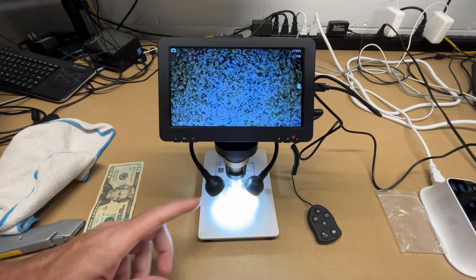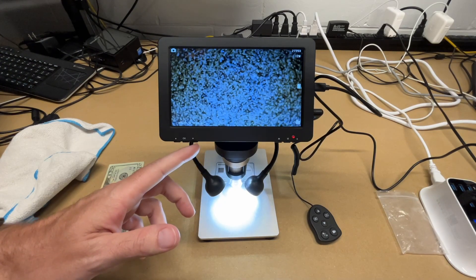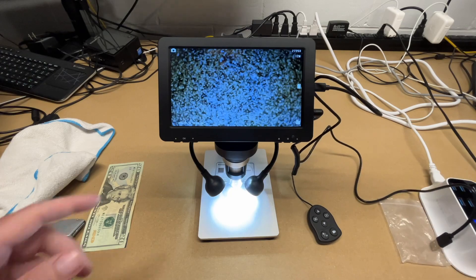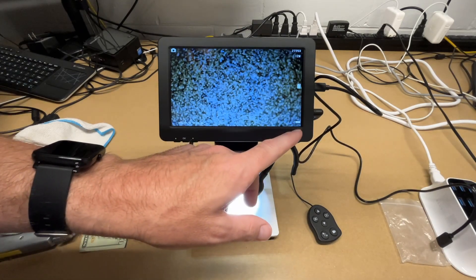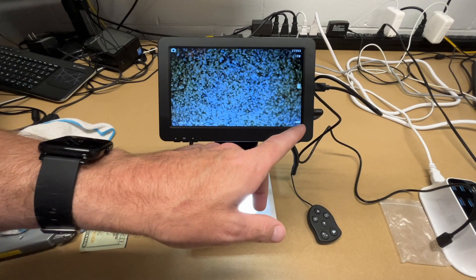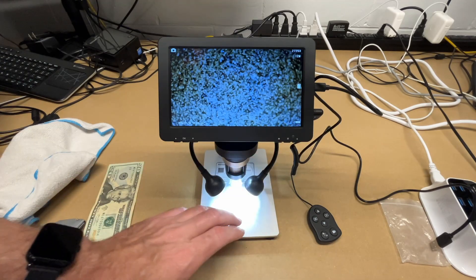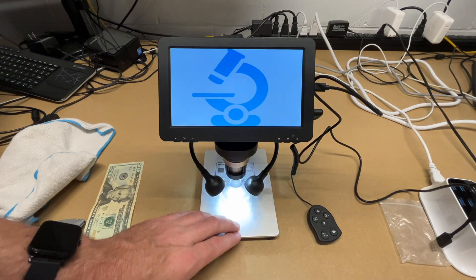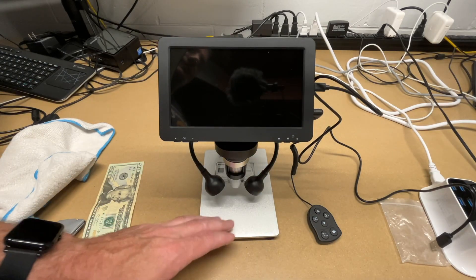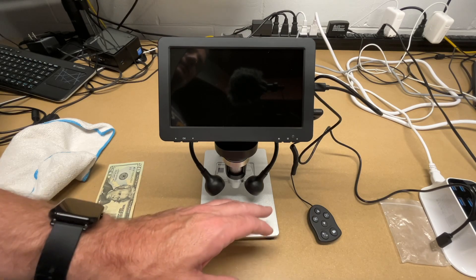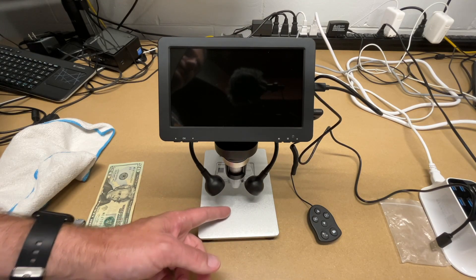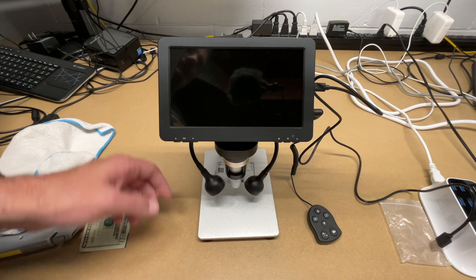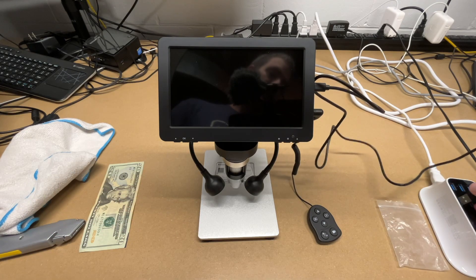So I had this plugged in. And this does have a battery in it. So I've charged it up. So if I unplug this, this will be running off battery power. And we have a little battery indicator. It's really small on the screen right here. There's a battery indicator there. So that makes this really handy. You can take this outside and look at leaves or things like that with it. You don't have to bring your stuff inside necessarily. Especially if you're looking at live bugs and stuff. If they get away, not a big deal. But I will plug it in just for now.